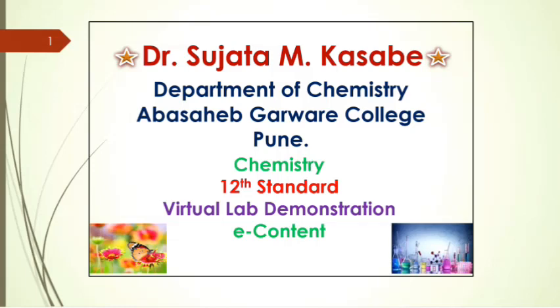Hello students, in this video we will see the chemistry practical for 12th standard.